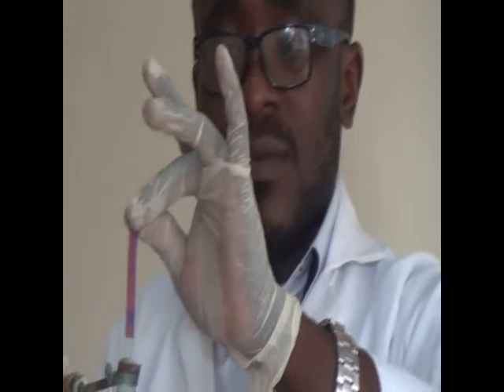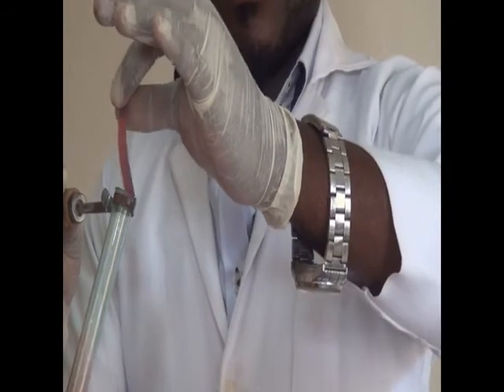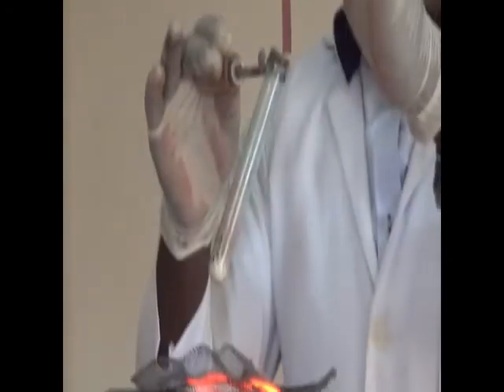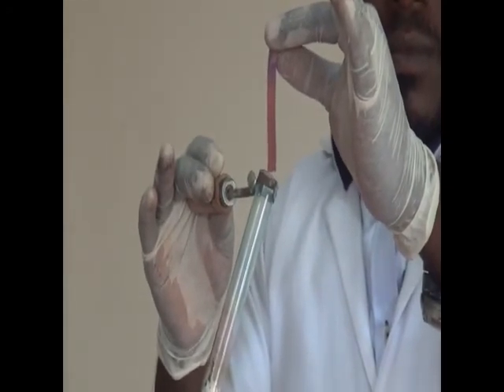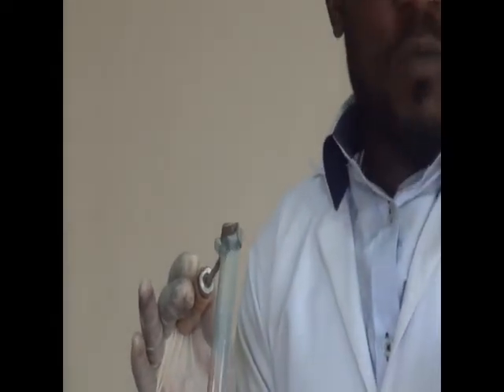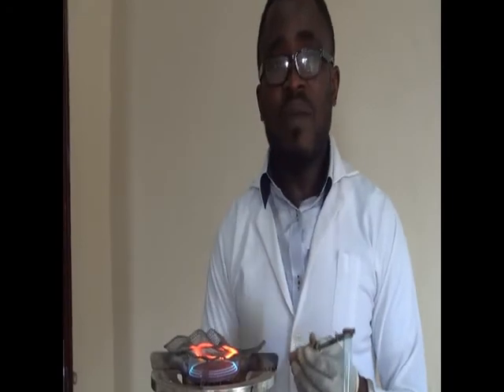Alright, now let's also test with red litmus paper. This is red litmus paper. The gas that is being given off causes no change for red litmus paper. It means this gas that is being given off is sulfur 4-oxide gas. Now let's go back to the board and see what happens there.